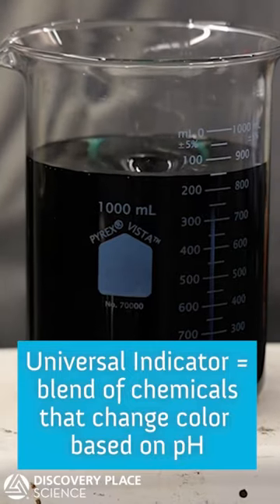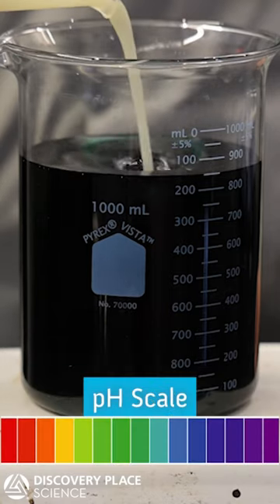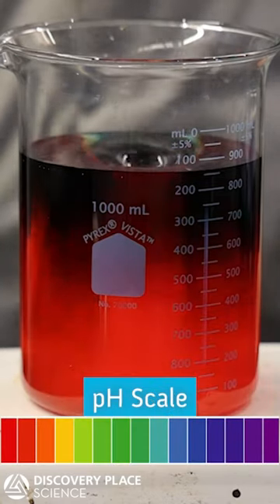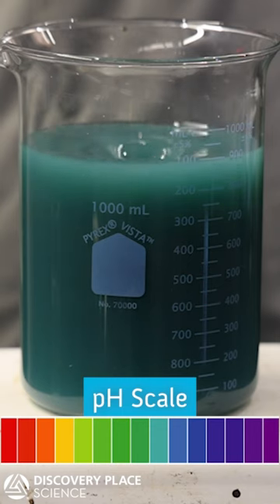Universal indicator is a blend of different chemicals that change color based on pH. Acids will turn the solution red, while bases will show up as blue or purple.